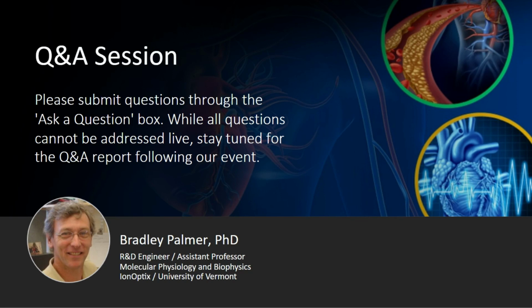And then the other question was about viability. We've been able to keep cardiac slices on the inverted microscope beating continuously at room temperature for 36 hours, and they're doing just fine. If we took a little bit more effort to keep them longer term, we could probably do that, because those slices, if put in the incubator, can last for weeks or months.